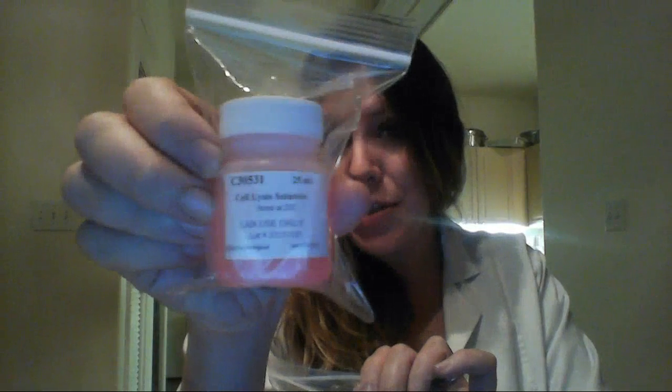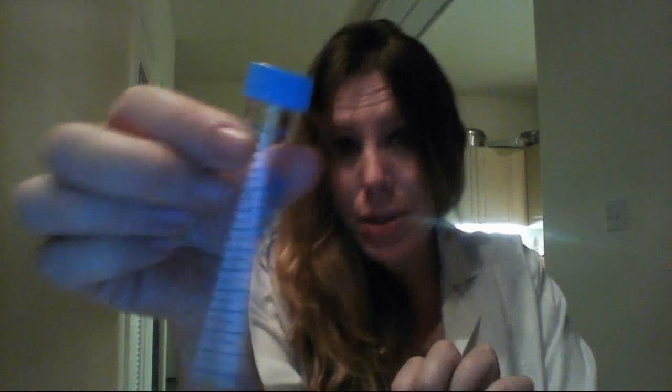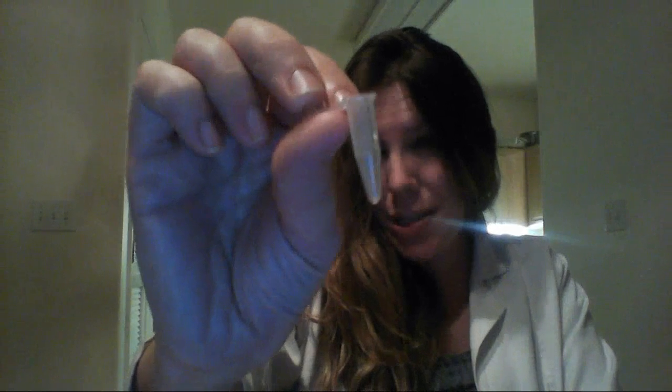Okay, so one of the things you'll find in your DNA necklace kit is the pink stuff, and that will say cell lysis solution, so you're going to need that. You'll have a 15 milliliter cap tube. We've seen these before. A little medicine cup, that's to spit in. A pipette. A little tiny tube here. This is actually what you'll be putting your DNA into to make a necklace. And a little bottle of ethanol.